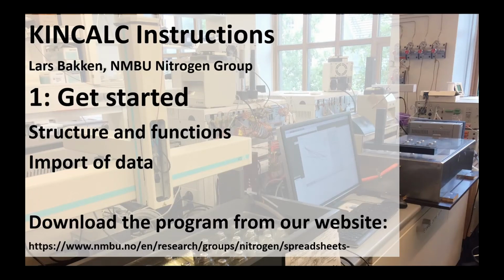This is the first of a series of videos to help you to use the KINCALC program. KINCALC is an Excel program designed to analyze data from experiments with incubation robots developed by the NMBU Nitrogen Group. It has become an indispensable tool for our group, and I strongly recommend others to use it, unless you want to walk across the creek for water.